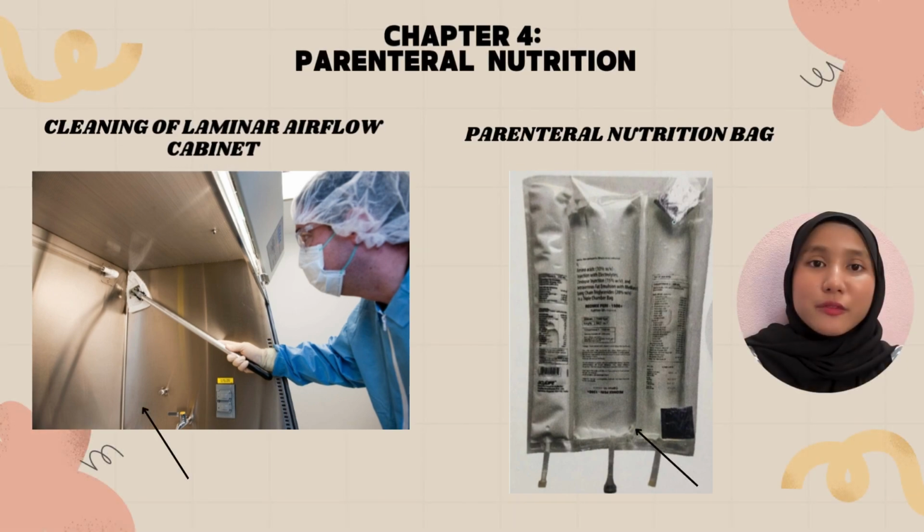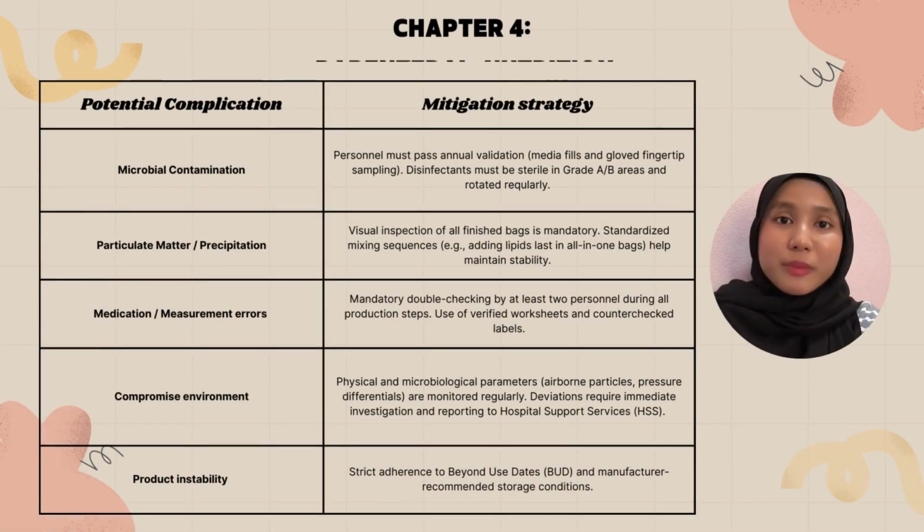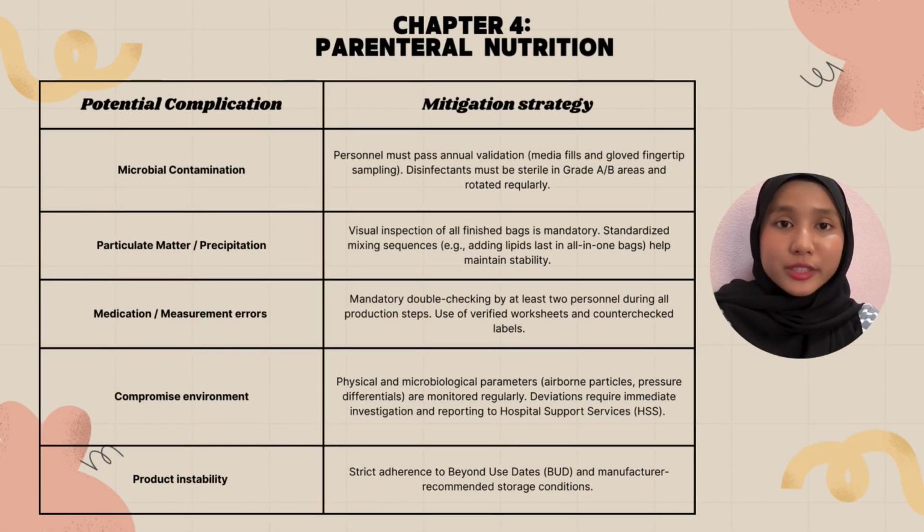Here, the laminar airflow cabinet is carefully cleaned to prevent contamination, ensuring a safe environment for sterile compounding. Once prepared under strict sterile conditions, the parenteral nutrition bag is ready for patient use and delivers essential nutrients safely and effectively. To ensure patient safety, we must mitigate 5 critical risks.